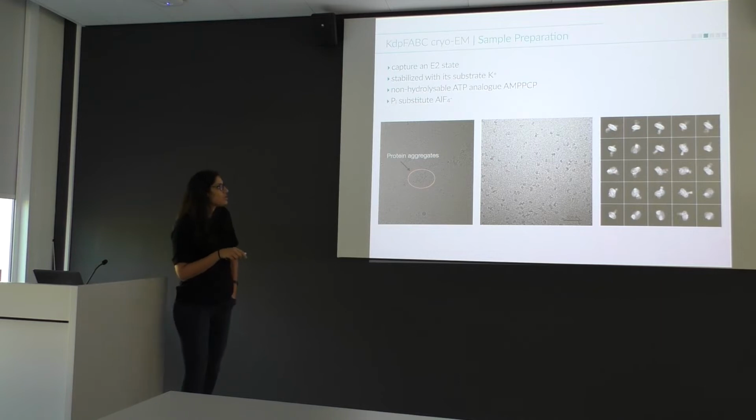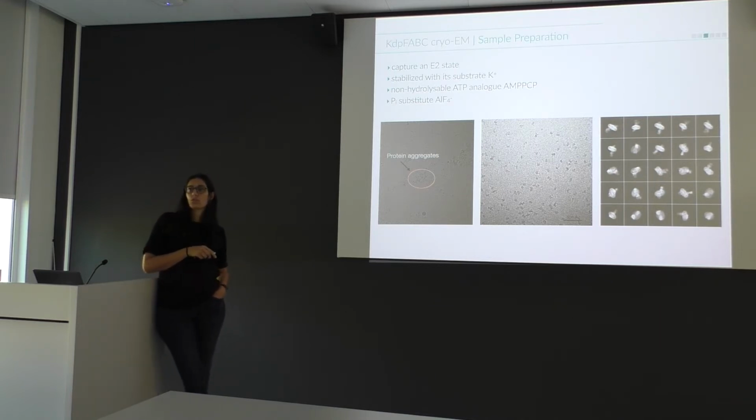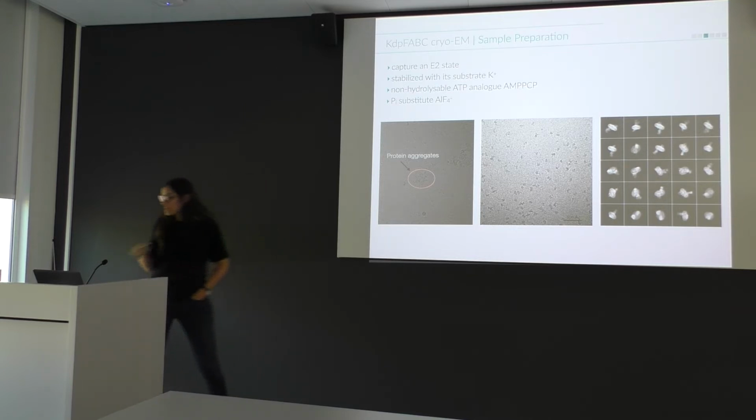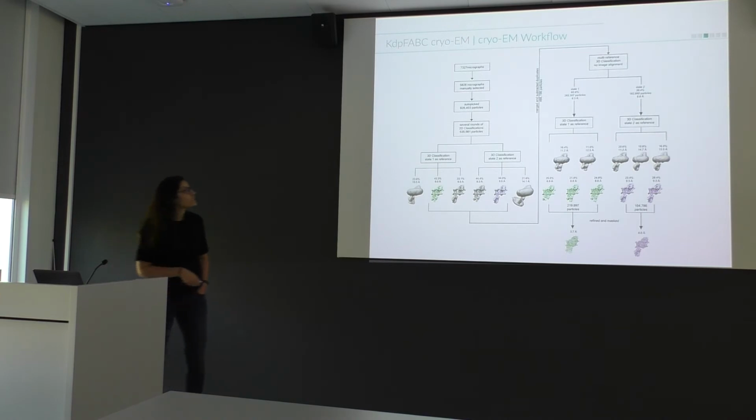So the take-home message here is really: prepare your samples fresh. This was also during the transition time when I moved to Groningen. At a certain point, we also started a collaboration with someone in Frankfurt to join forces, because otherwise we would not make it in time. And then the deal was really, okay, we need to purify it where we freeze the samples right away, and this really made the difference.